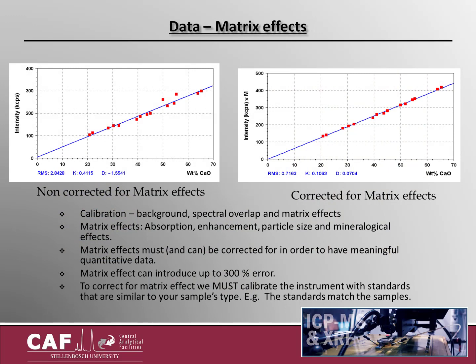After we set up an analytical program or application with the appropriate selection of spectrometry components, we will need to calibrate before analysis can occur. Unfortunately, calibration in XRF is not an easy task and is time-consuming to provide good quality calibrations. But once a calibration setup is completed, it only requires recalibration once a year, more or less, with the use of a drift monitor correction.